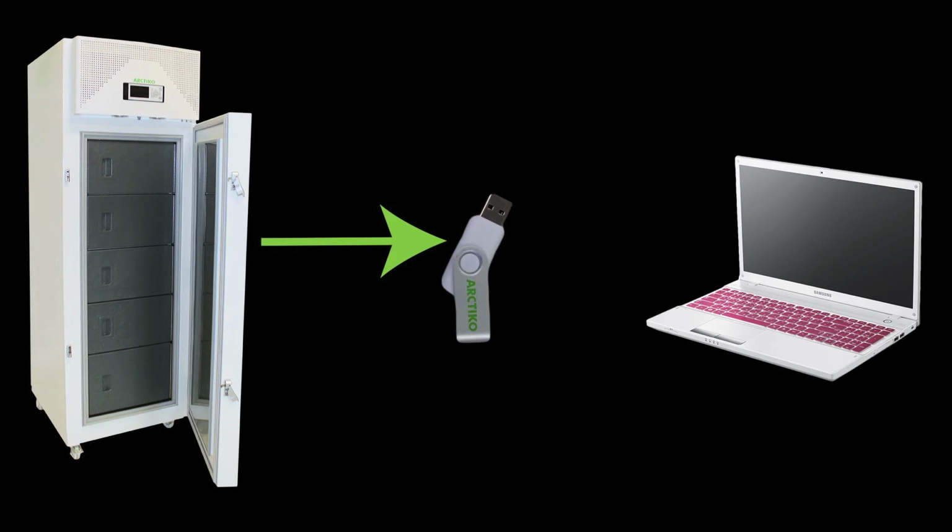Place the USB pen drive in the unit and the data will be saved. Insert the USB pen drive in your computer and open the file with Excel.